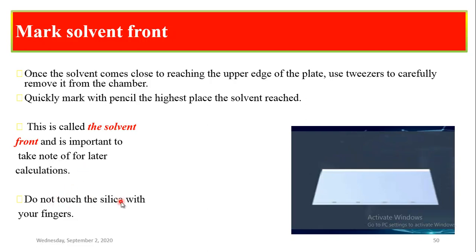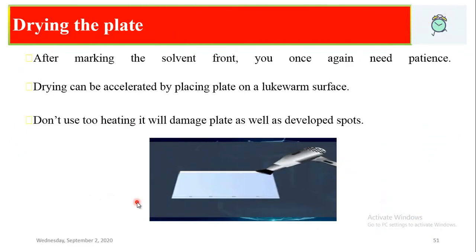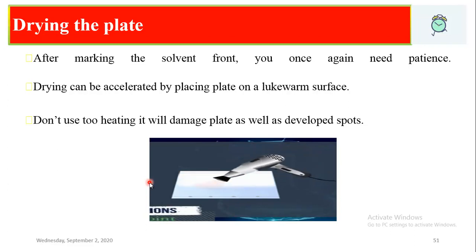Do not touch the silica with your finger. After developing, we will dry the plate. After marking the solvent front, a simple drying method is used, a simple dryer, which will not damage the plate, so only small heating is used.